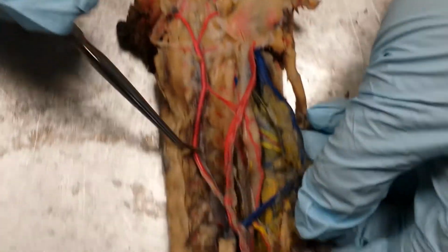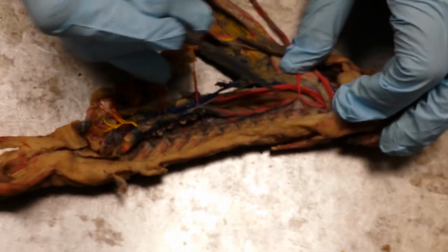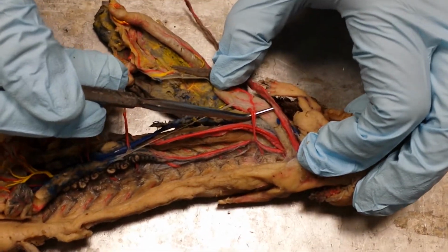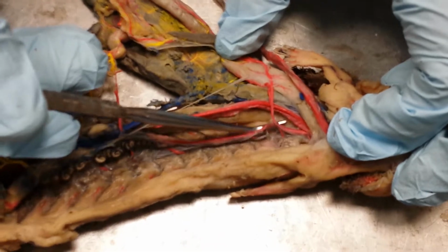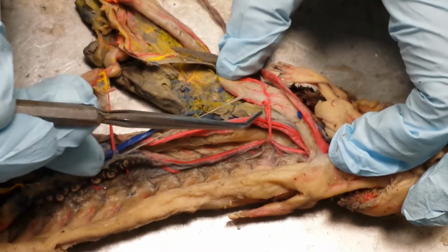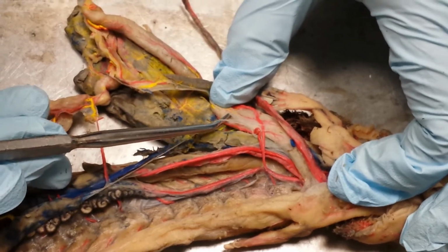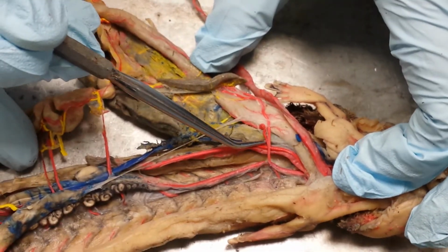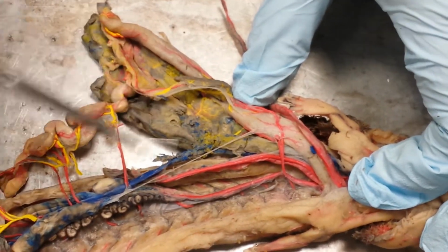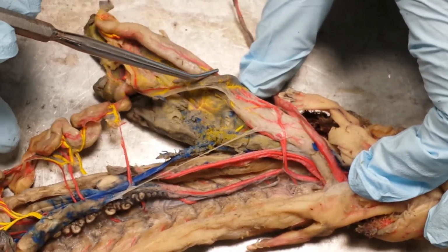Okay, if we follow the dorsal aorta down into the abdomen of the salamander, see right there? The first thing you're going to notice is that there's this big branch coming off of it, more toward the top. And this branch is called the celiaco-mesenteric artery. The celiaco-mesenteric artery then divides or branches into one part here that goes straight to the stomach. That would be your gastric artery. And then if you follow this branch here, you can trace it all the way to the spleen, and that would be your splenic artery. Okay? So dorsal aorta, celiaco-mesenteric artery, gastric artery, splenic artery.